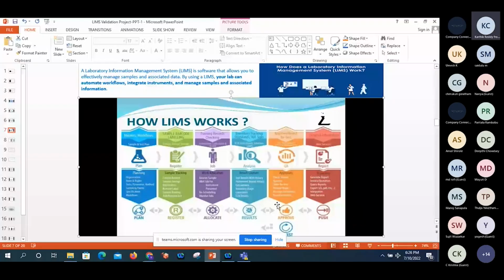There is also an inventory management module. It should be manageable through LIMS only. The inventory management module handles huge amounts of chemicals, reagents, volumetric solutions, and working standards. All of this can be easily managed here. Once the test report is there, there is also approve or reject of the test report. The QA approver can approve the COA generation, some of the trend reports, and some of the stability summary reports, everything. Once the data is generated, an archival system will be working on the system. It should be saved into the central server system.